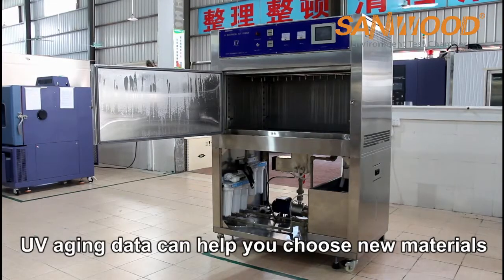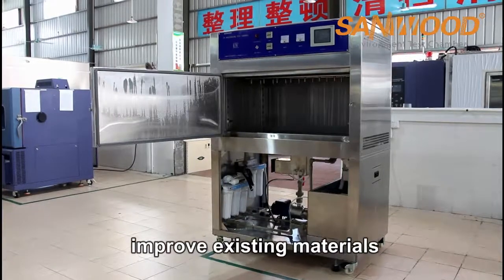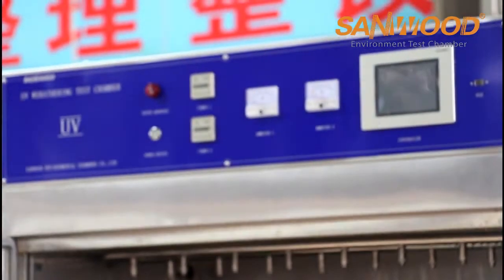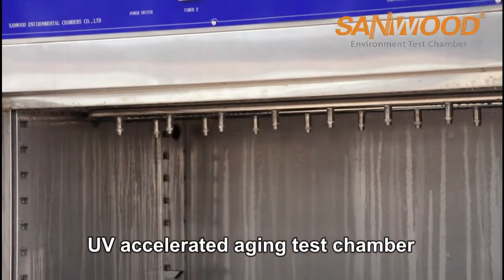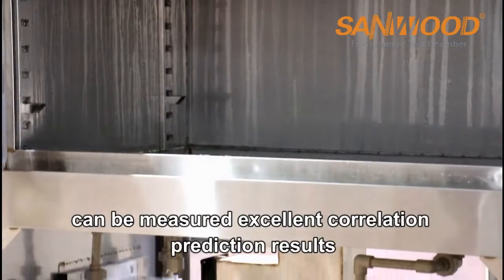UV aging data can help you choose new materials, improve existing materials, and evaluate how these changes affect product durability. In the case of materials placed outdoors, the UV accelerated aging test chamber can provide excellent correlation and prediction results.